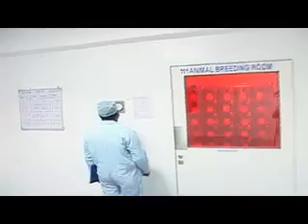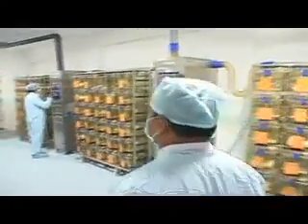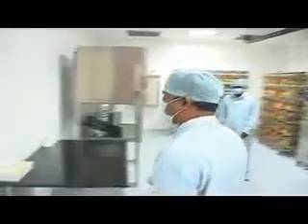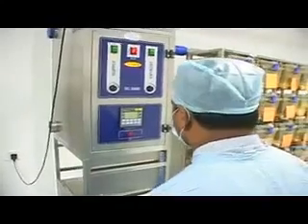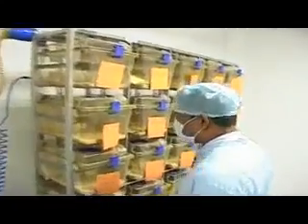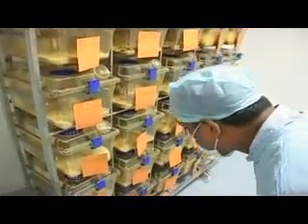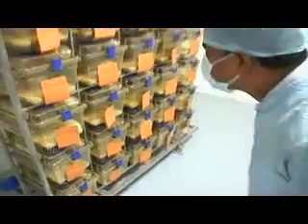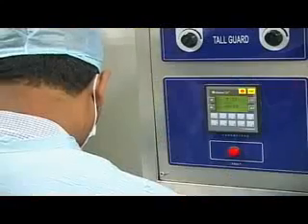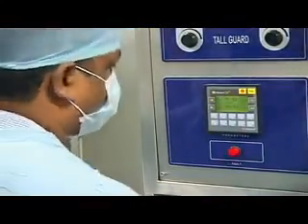Individually ventilated cages, the IVCs, get input air through a HEPA filtered system and are run by the air handling unit of the IVC. The exhaust air in the IVC is connected to the exhaust duct system of the room. The use of IVCs contributes to achieving a class 10,000 area, the highest barrier function, social interaction, and psychological and behavioral needs of the animals. It also enables easy access to food and water.